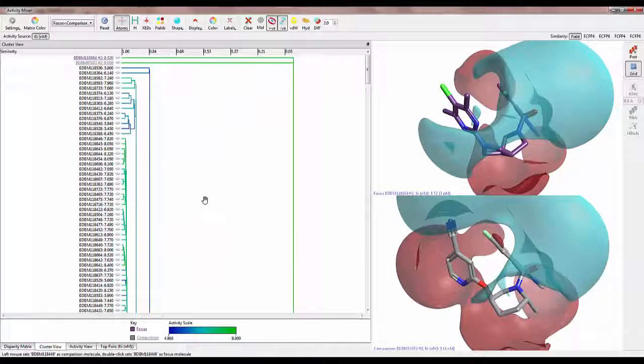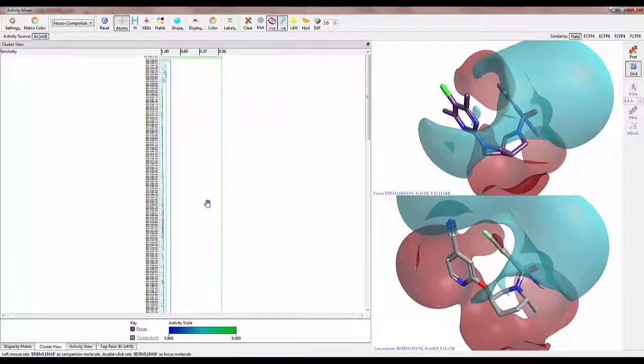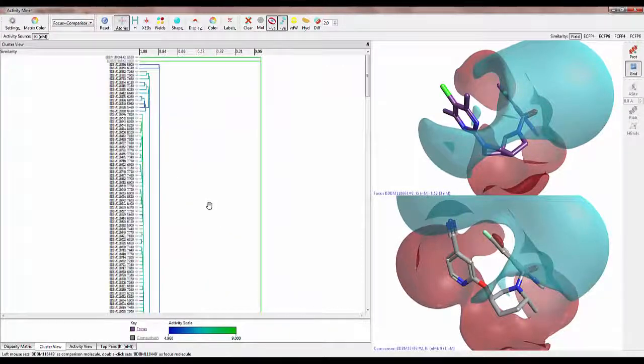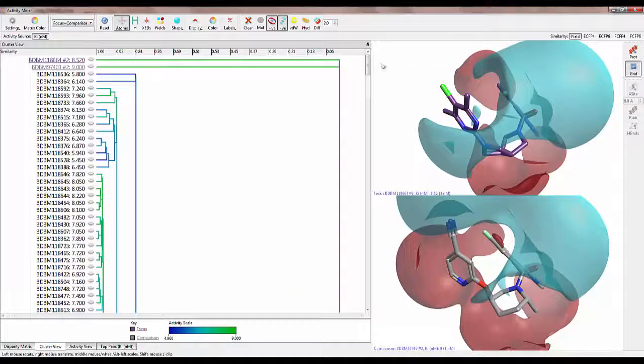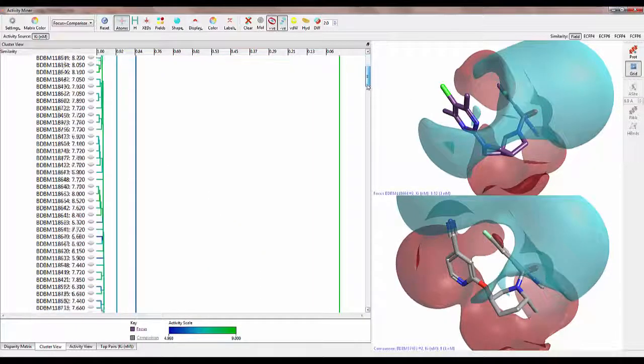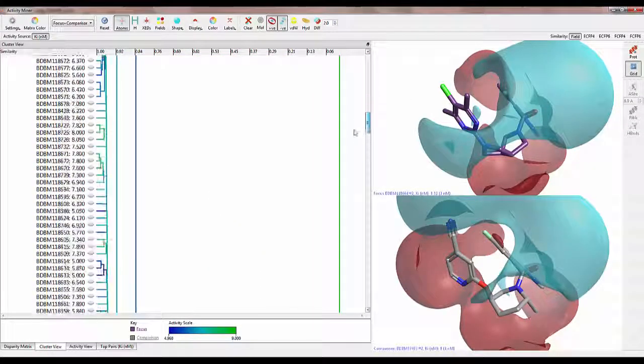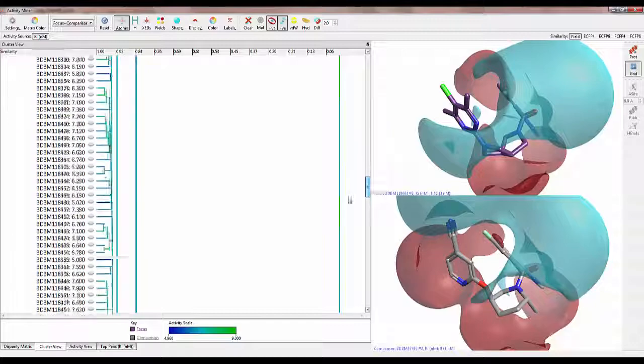During this calculation, ActivityMiner also clusters the molecules and presents the results in a dendrogram.